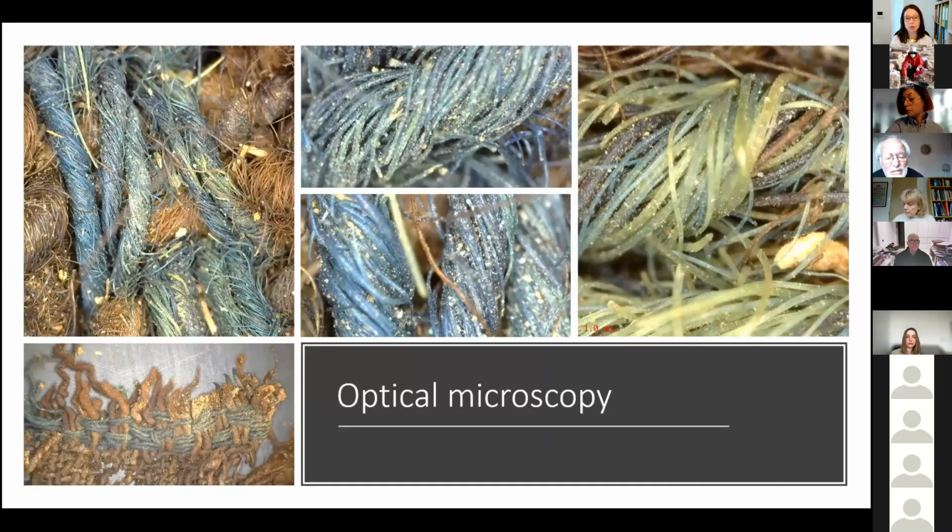So usually I worked with, now I think most of you know, this kind of big pen digital microscope, which is just linked to your computer, and it gives you immediately an image at different magnifications. And as we are talking about dyes, as John Peter observed, you can see, of course, because there is the mechanical use of the fibers, that it's like your blue jeans. You can see that when you wear them after a long time, there are areas where the blue has just gone. It's because of this mechanical friction. So that's the first possibility.